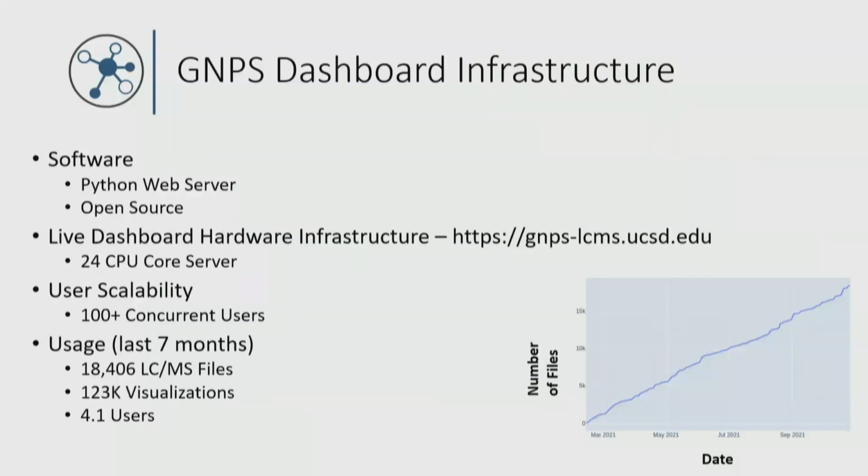But I just want to give you a little bit about the hardware background and implementation very quickly before we get to the exciting stuff. It's open source. You can go and download. It's a Python web server running on our own servers right now, but you can deploy it on your own systems if you want. And we think it's reasonably scalable. We're no Google, but we've been able to work with the community during workshops with over 100 users, and in classroom settings as well.